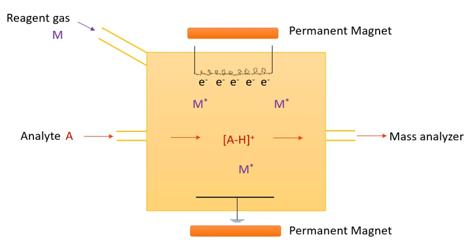Compared to the other methods involving negative ion techniques, NCI is quite advantageous, as the reactivity of anions can be monitored in the absence of a solvent. Electron affinities and energies of low-lying valencies can be determined by this technique as well.